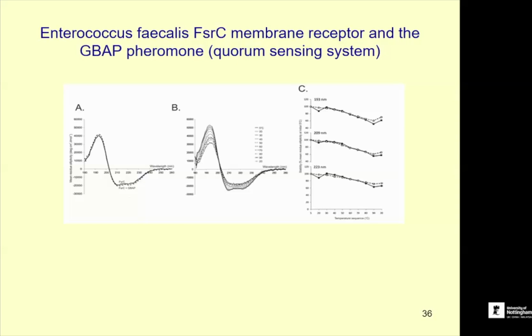It depends what the proportion of those are. A protein can be predominantly alpha helical, and you'll see the spectrum of an alpha helix, even though it's carrying small amounts of other types of secondary structure. It'll take the predominant one and reflect that in the spectrum. If it was 50-50, I think you'd probably end up with something that was in between the two spectra.